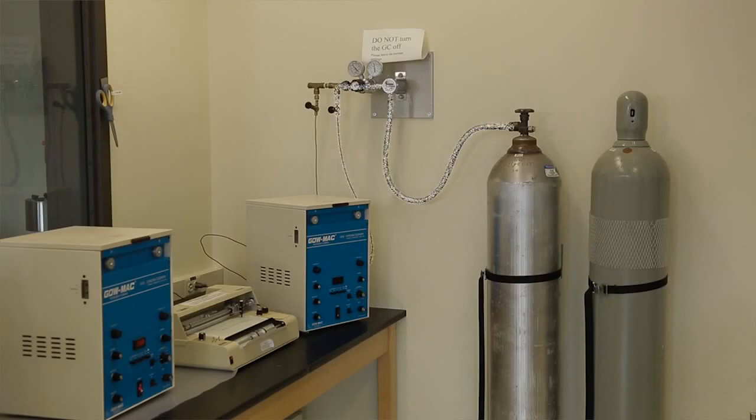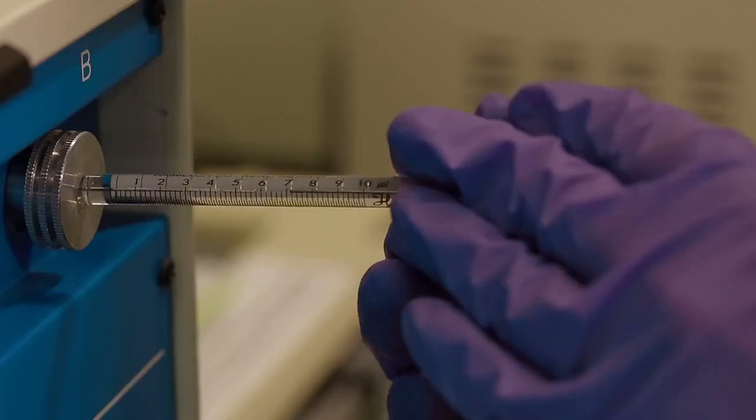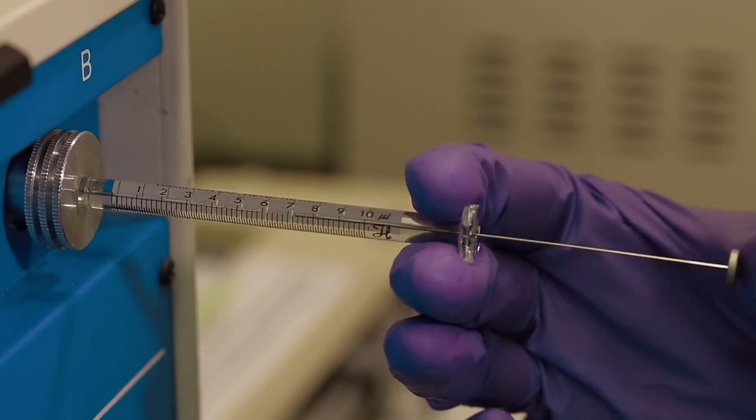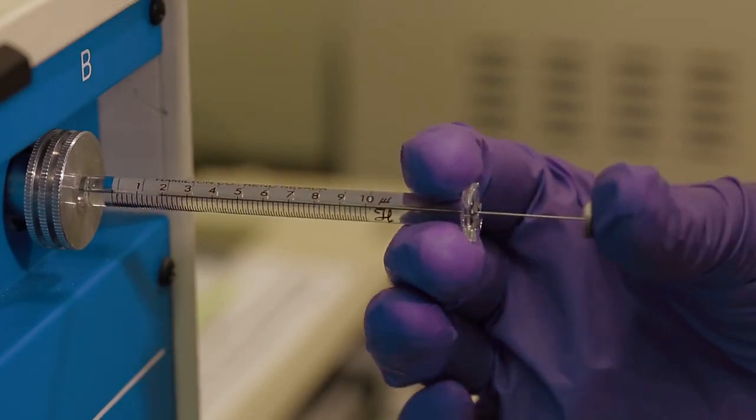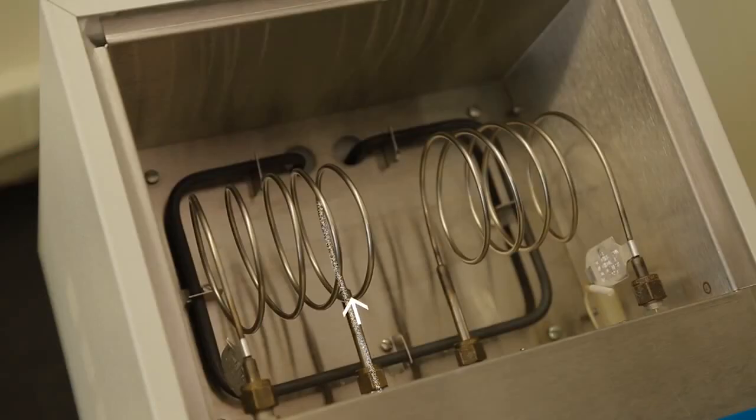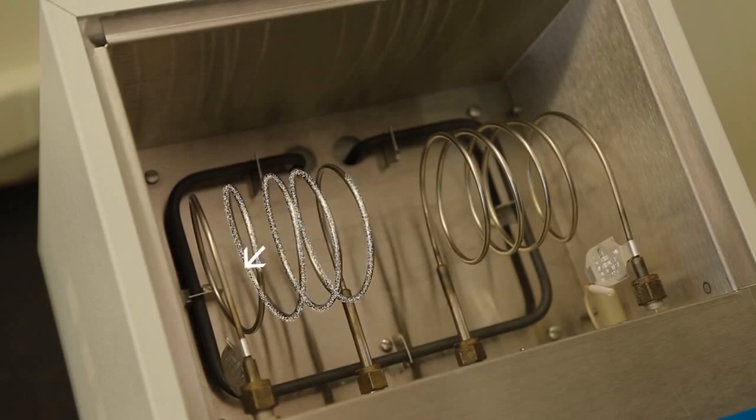Helium runs through the column and is the mobile phase. A sample injected into the gas chromatograph is instantly vaporized in a heated injection chamber so that the components are in the gas phase, and then it flows through the column. The helium is the carrier for your sample.